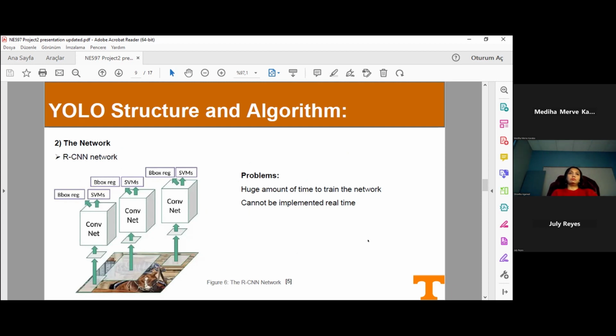What is the convolution layer used for? A convolution layer transforms the input image in order to extract features from it. In this transformation, the image is convolved with a kernel. A kernel is a small matrix, as I mentioned in the former slide, with its height and width smaller than the image to be convolved. It's also known as a convolution matrix or convolution mask.